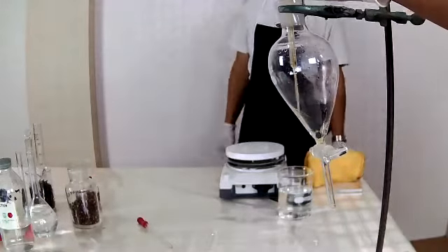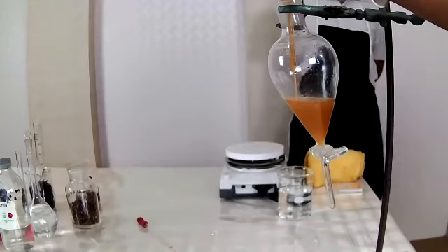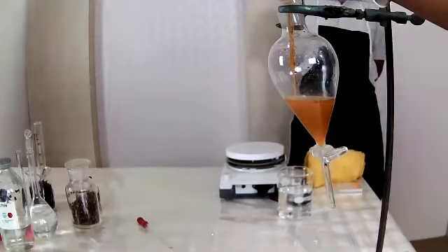we pour this back in the funnel to extract the eugenol.